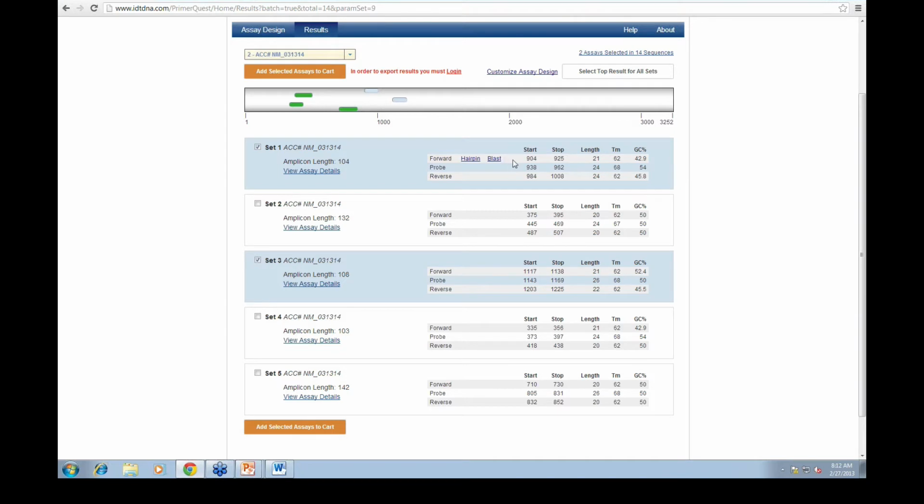As you can also see, when I hover over any of these lines, I have the option to check the hairpin structure of the sequence or BLAST the sequence. Since we are doing this design live from the tool, we don't have time to BLAST for cross-reactivity or check for SNP locations or anything like that, as it is trying to provide designs as fast as possible. So once you choose a primer or an assay that you are comfortable with or would like to order, we would recommend manually BLASTing it to check for cross-reactivity after receiving the primer sequences.